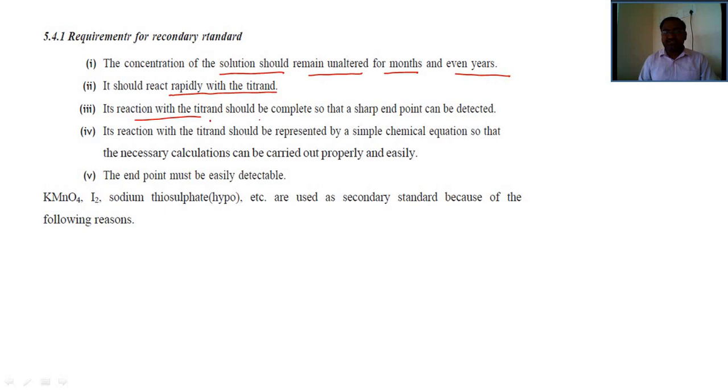Its reaction with the titrant should be complete so that a sharp end point can be detected. Its reaction with the titrant should be represented by a simple chemical equation so that the necessary calculations can be carried out properly and easily. The end point must be easily detectable.